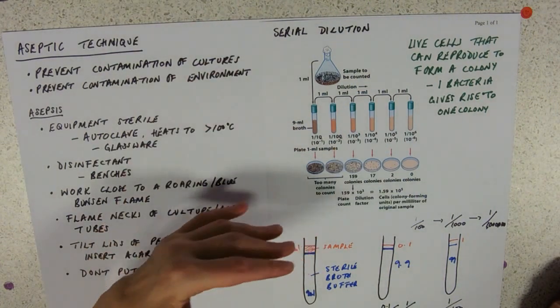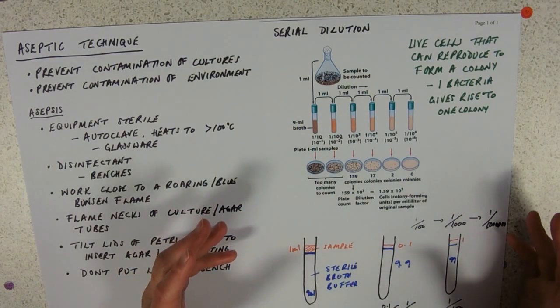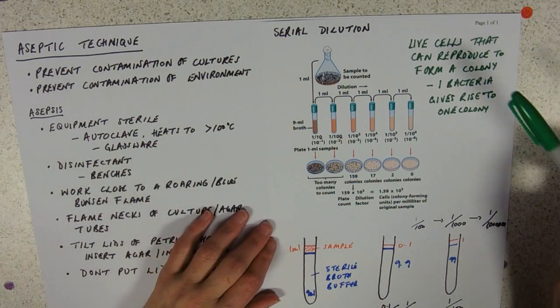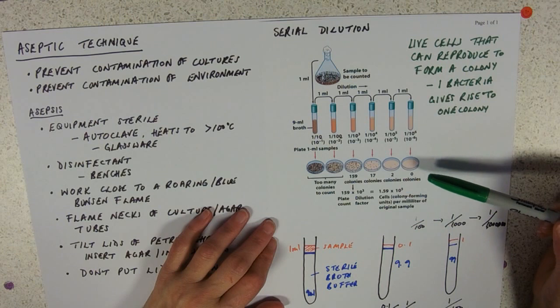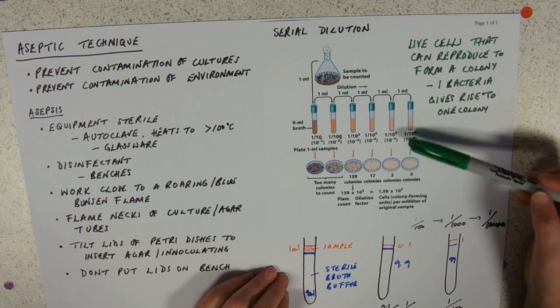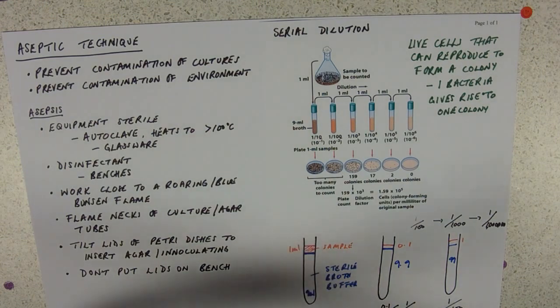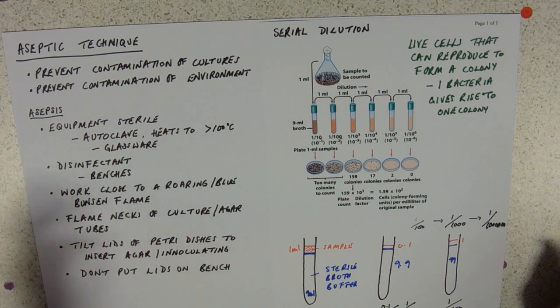So once you've done all that aseptic sterile transfer and you've mixed them all up so they're nice and evenly dispersed, the next stage is to get them to produce these colonies, and we can do that by transferring them onto a sterile agar plate. So you need 1 for each dilution. Generally, and certainly when we did it, we would probably have only done 2 dilutions per team, because otherwise it's a heck of a lot of equipment. But were you doing this at university, for example, or as part of your job as a microbiologist, you would be plating out all of them.